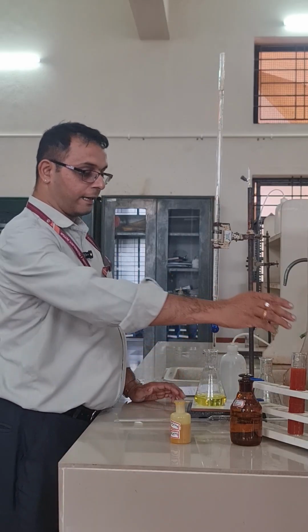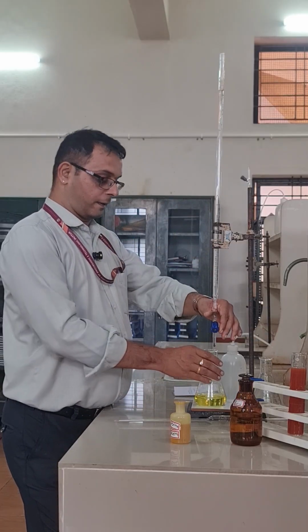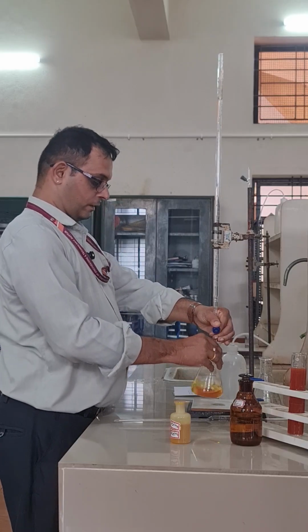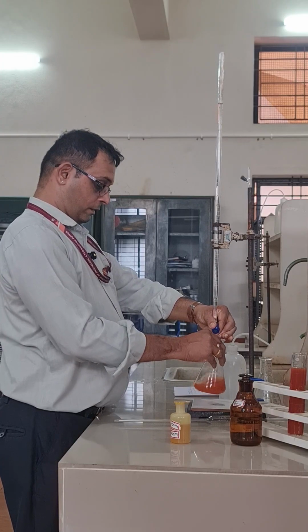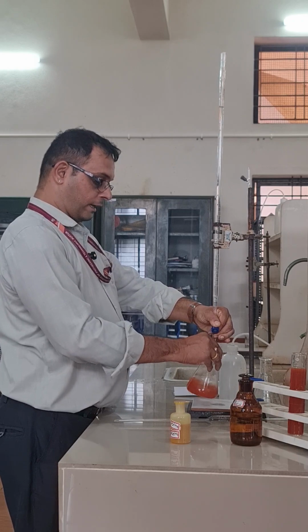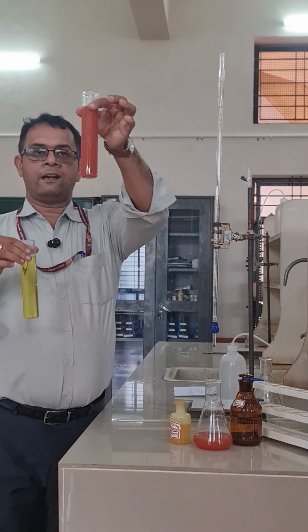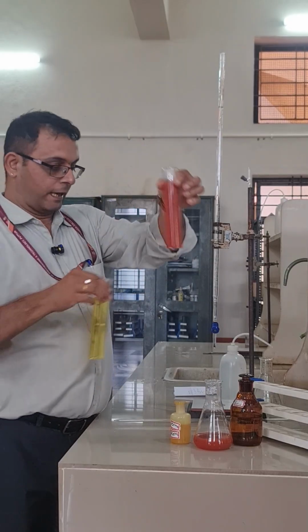Now we have to titrate the sample with the AgNO3 until it turns brick red. We should be very, very careful while doing the titration. If the water is not contaminated, the red color will come very, very early. Now you can see the brick red color, right? So initial is greenish yellow, and the end point is brick red.